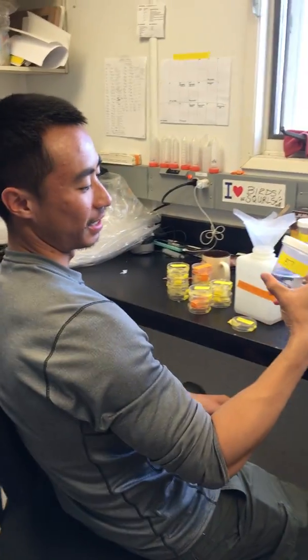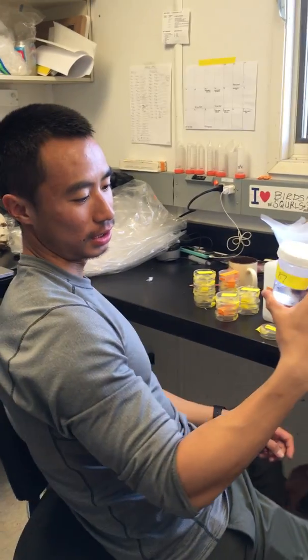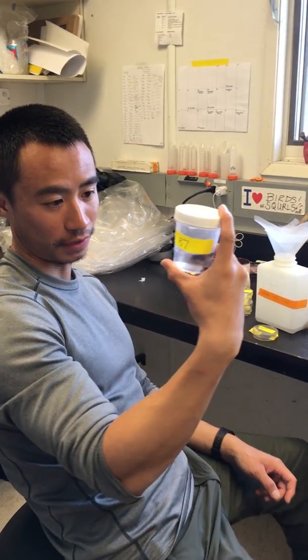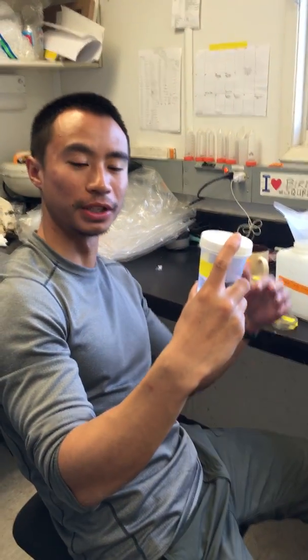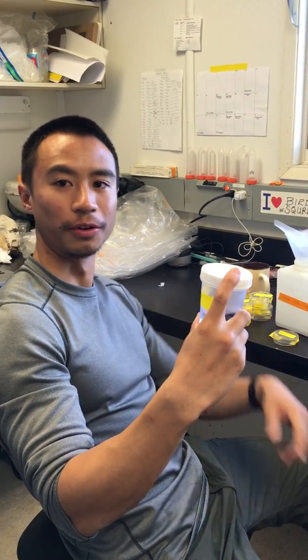Hi, I'm Jeffrey, and this is a sample from a pitfall trap we set two days ago. So in here we have 50% ethanol, and bugs just walk across and they fall into our cup, and then they die in the alcohol.